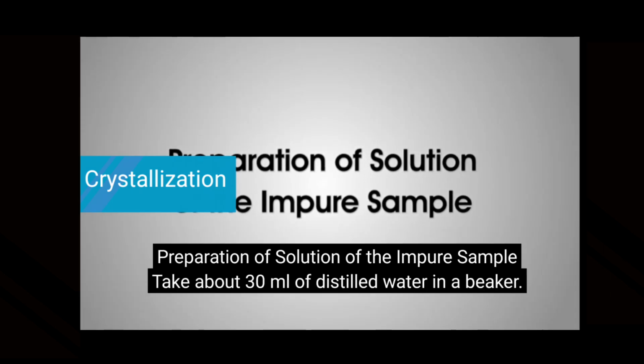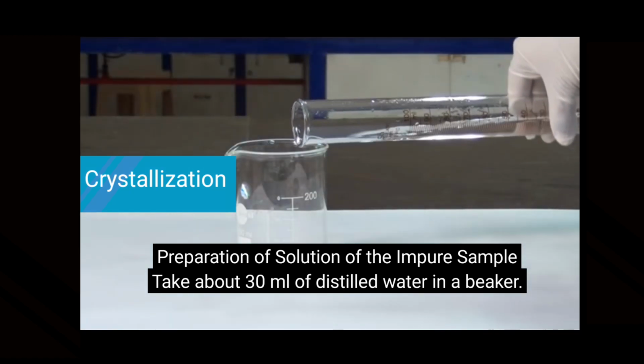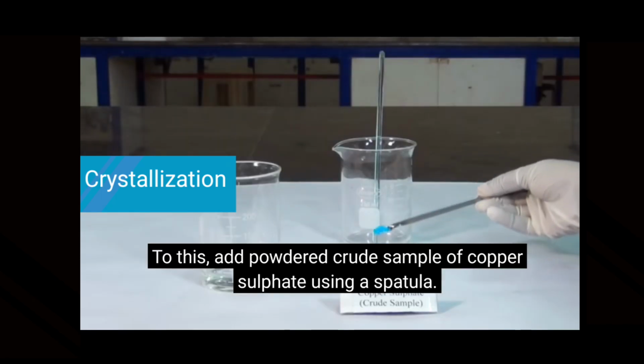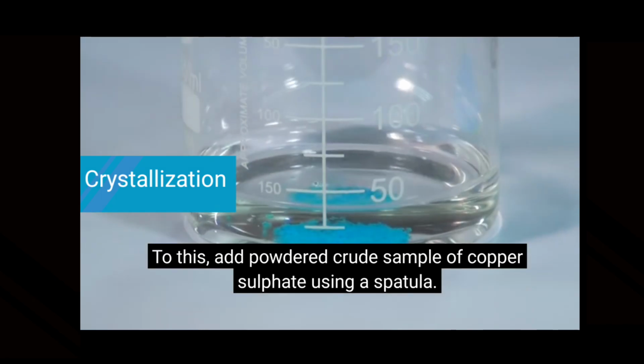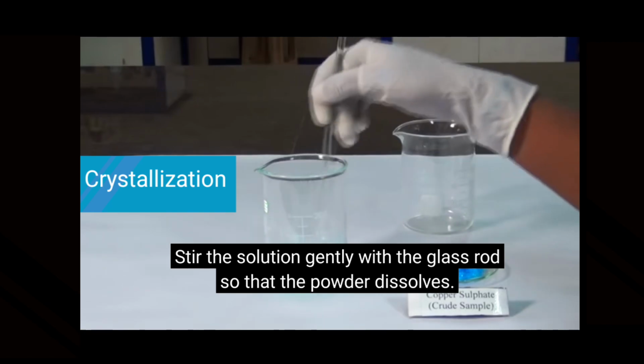Procedure: preparation of solution of the impure sample. Take about 30 ml of distilled water in a beaker. To this, add powdered crude sample of copper sulphate using a spatula. Stir the solution gently with the glass rod so that the powder dissolves.